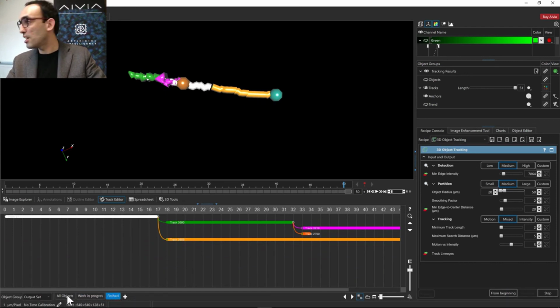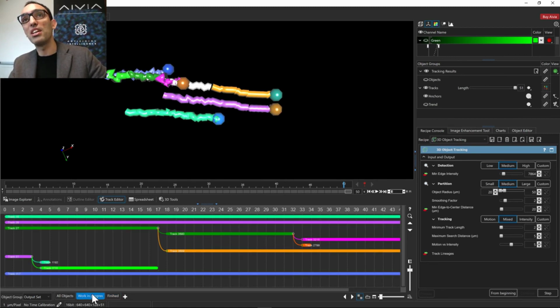This is all objects, so that's workspace 0. This is 1, 2, 3, 4, 5. So you have shortcuts on the keyboard to move tracks to different workspaces. Actually, it's not moving, it's mirroring. So they exist still on the other one. So this still exists here.